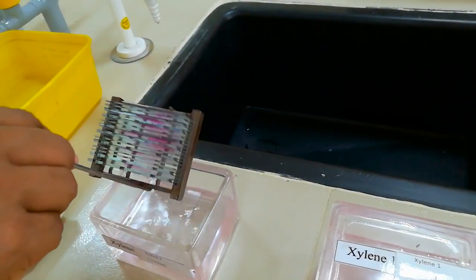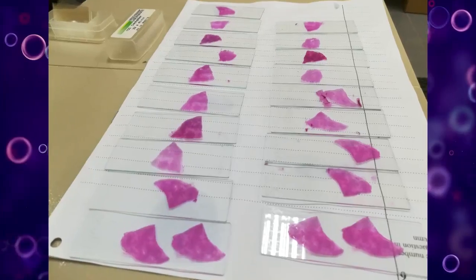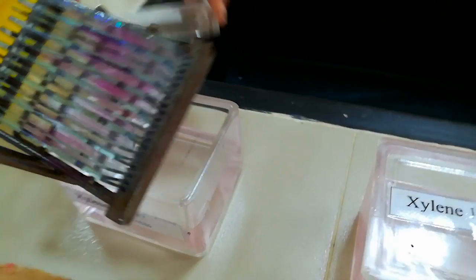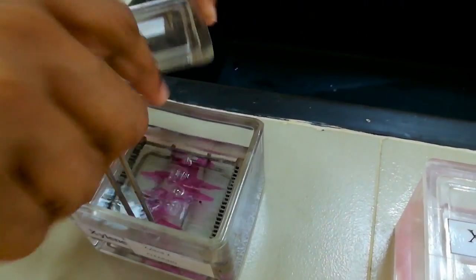Remove a slide from the staining rack, holding it horizontally by the edges of the frosted label end. Dip the slide into clearing agent again if drying has occurred.